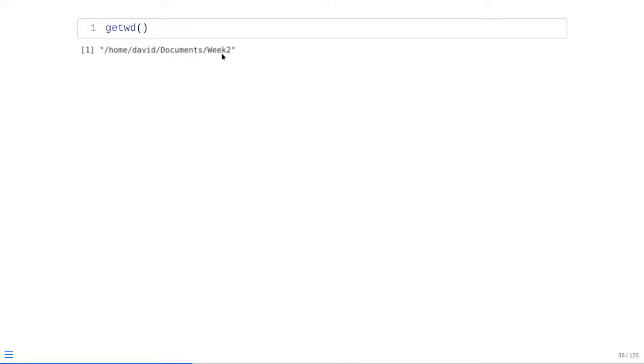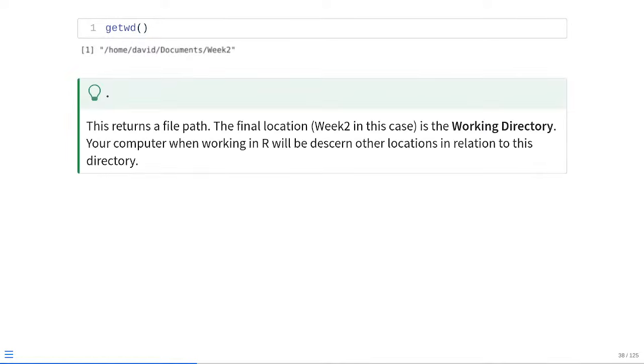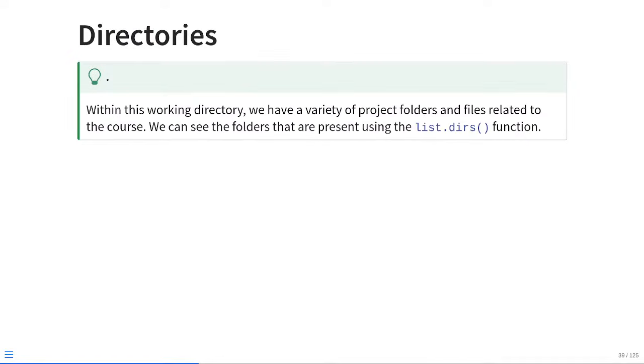So what your computer sees is basically anything that's right adjacent to the week 2 folder. And this is what we'll know as your active working directory. So when we're working within your working directory, if we're looking within the Positron window, we know we just created this project. We know we just created 2 folders, data and images.